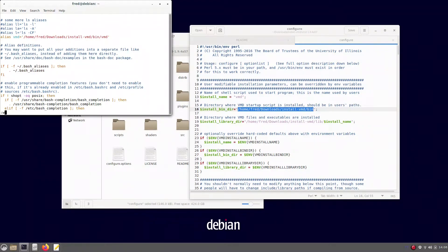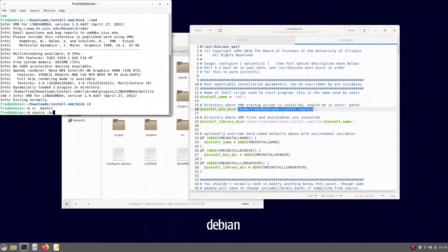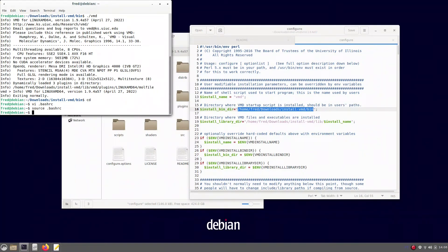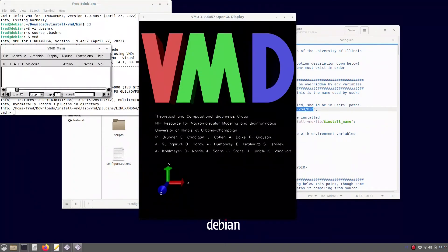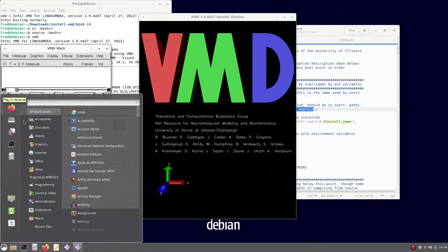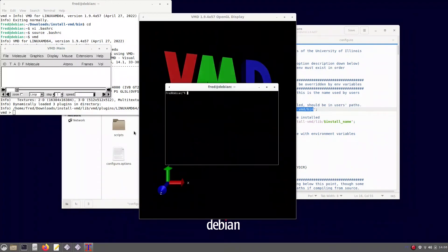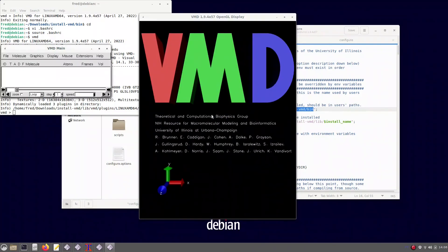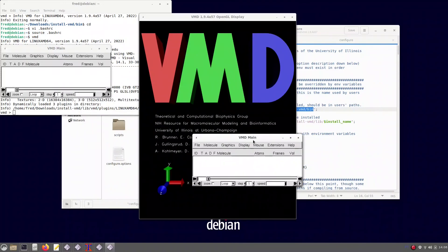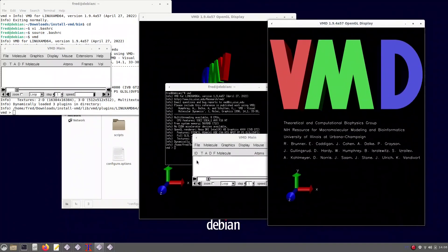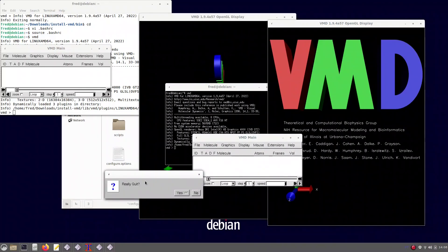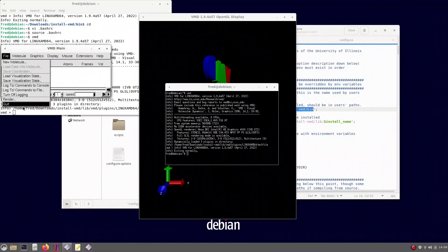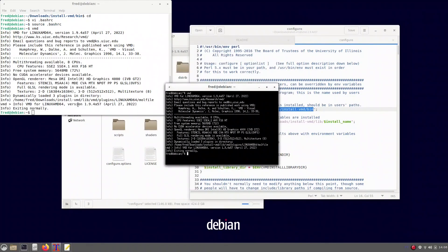Make sure the single quotes are okay. To save that in vi, you have to type colon, w, q, and enter. Then you have to reload the dot bashrc by typing source. You are just fine. To make sure that everything is working, you can open another terminal and just type VMD and enter. As you can see, it's working — we have opened two VMD instances. I hope you all enjoy. Good luck with using VMD and Red tool. Bye-bye.